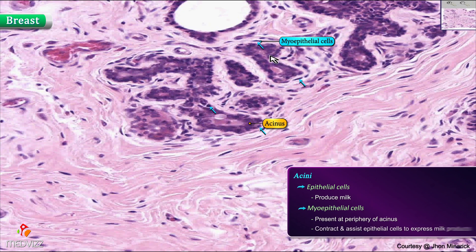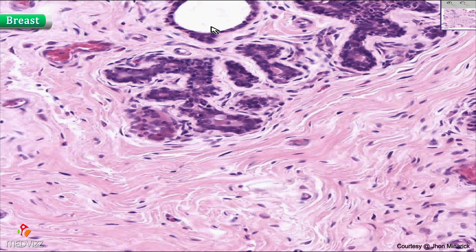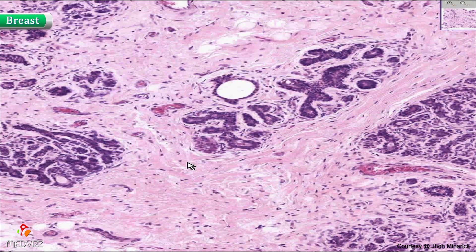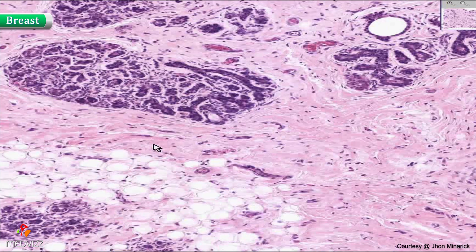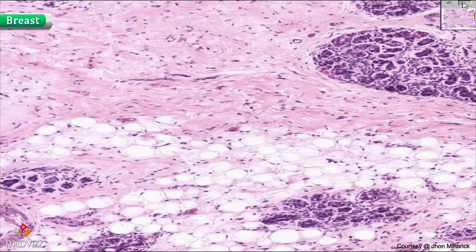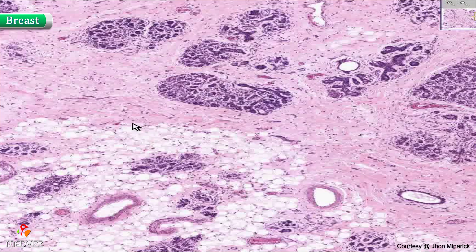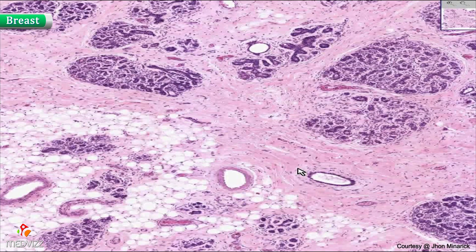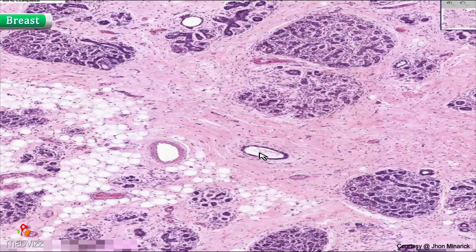The myoepithelial cells contract and they assist the epithelial cells to express the milk product through these ducts — first intralobular, and then ultimately into larger ducts which are between the lobules, like here, and then ultimately into larger ducts and through the lactiferous ducts through the nipple.